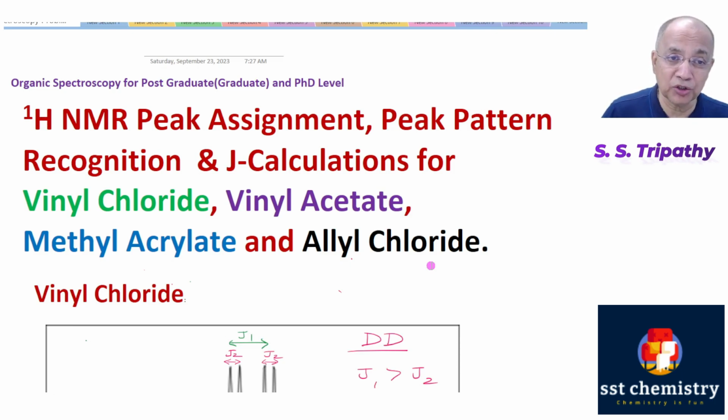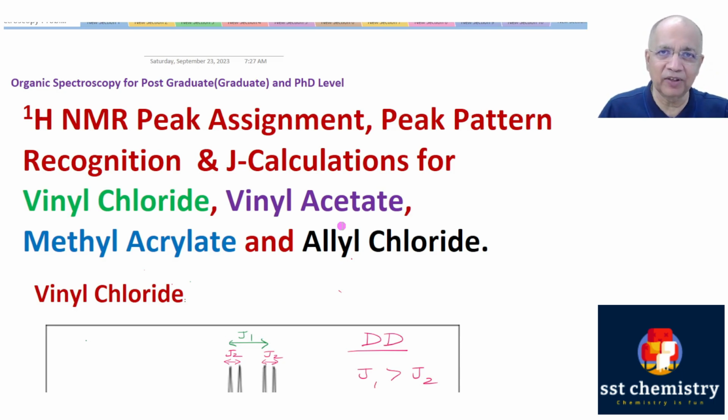the respective protons. It appears to be a very simple problem because these compounds are very simple, but you will find an interesting observation, particularly in methyl acrylate and allyl chloride. And I have taken these two simple compounds just to evolve the topics for graduate level students. And these programs, as you know, are meant for graduate level students, research scholars, PhD students, and maybe undergraduate level students, if interested, can take the benefit of this program.